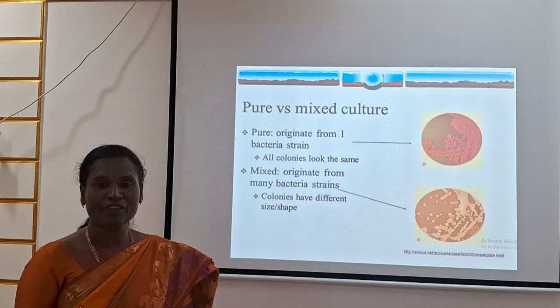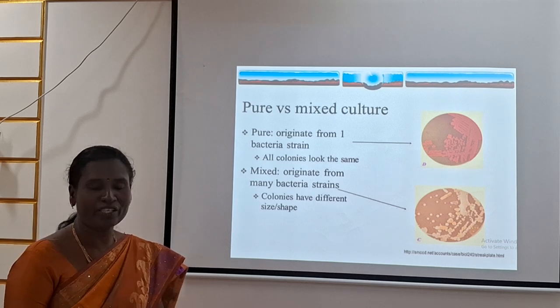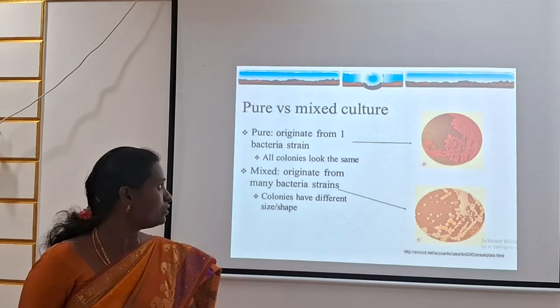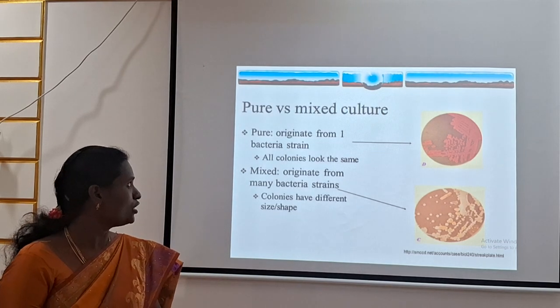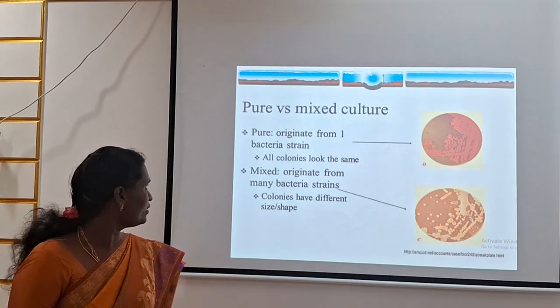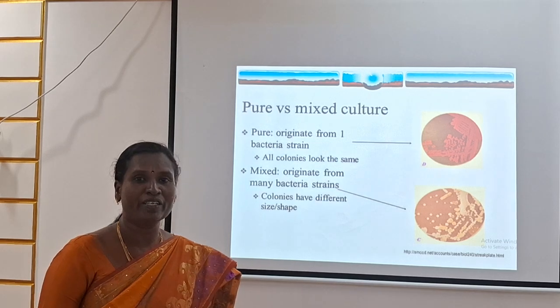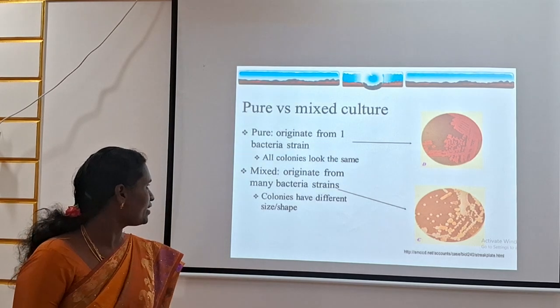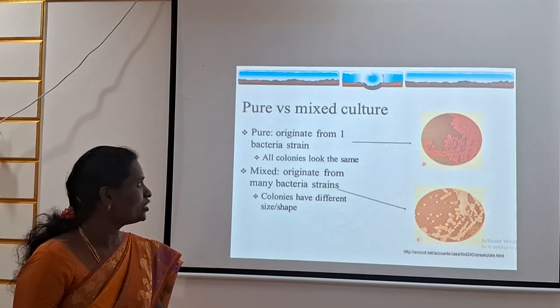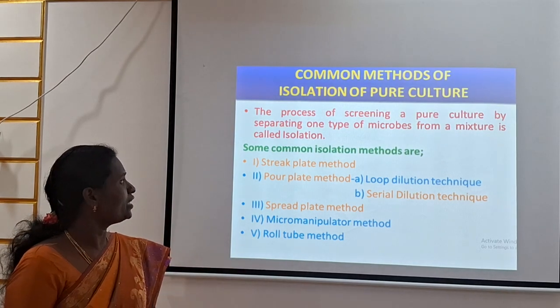Pure culture versus mixed culture. Pure cultures originate from a single bacterial strain, so the colonies look the same. A mixed culture originates from many bacterial strains, so the colonies are of different sizes and shapes. We have to differentiate the species.